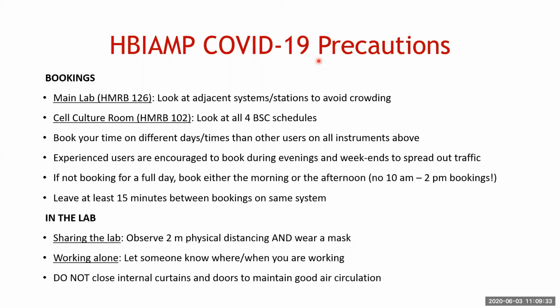If you're sharing the lab, we need you to wear a mask, and it's just good protocol. So just make sure you wear a mask if you're in there with other people. If you're working alone, especially at night, make sure that you let people know where you are. Please keep all the internal curtains and doors open, just to maintain circulation. The confocals are really good. The pinholes are always closed, so the light is not going to affect you very much. So don't pull those curtains closed, please.